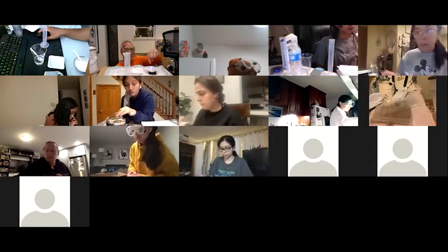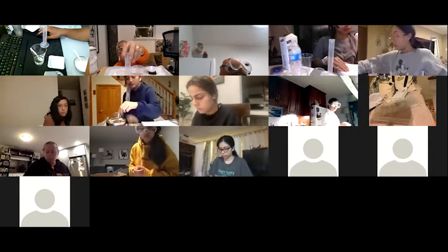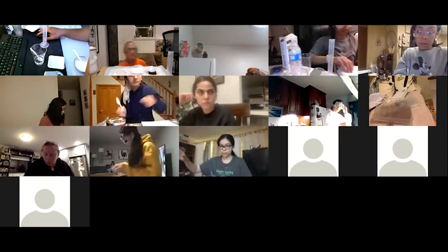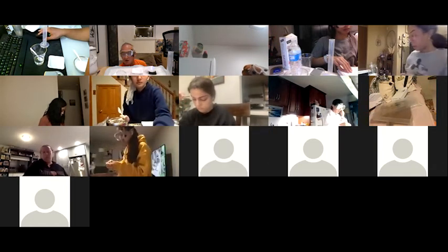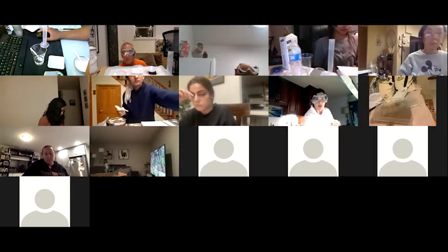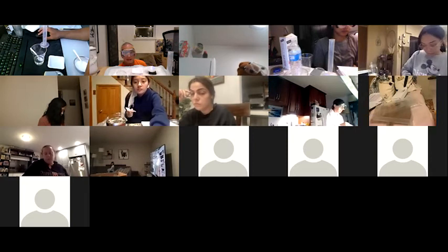And now I put 5.5 grams of sucrose in the weigh boat. Once I've got my 5.5 grams, I transfer it to the liquid and stir it until it's dissolved. Because if we added the solid directly to the liquid and went over, there's really no way of removing solid from a liquid. Once it's dissolved, it's in there. So we can't really do that.